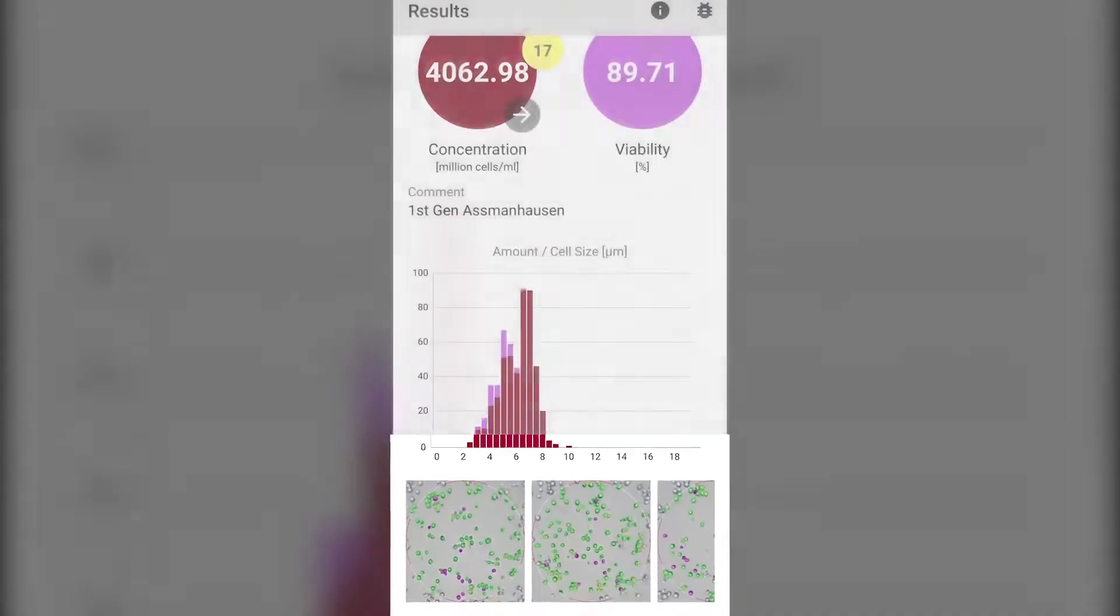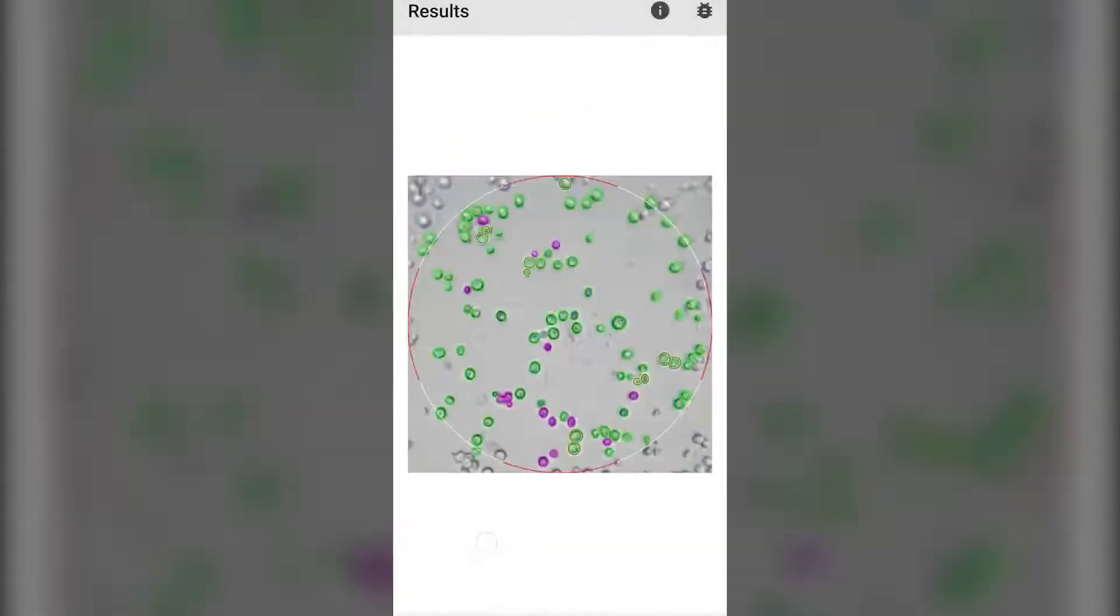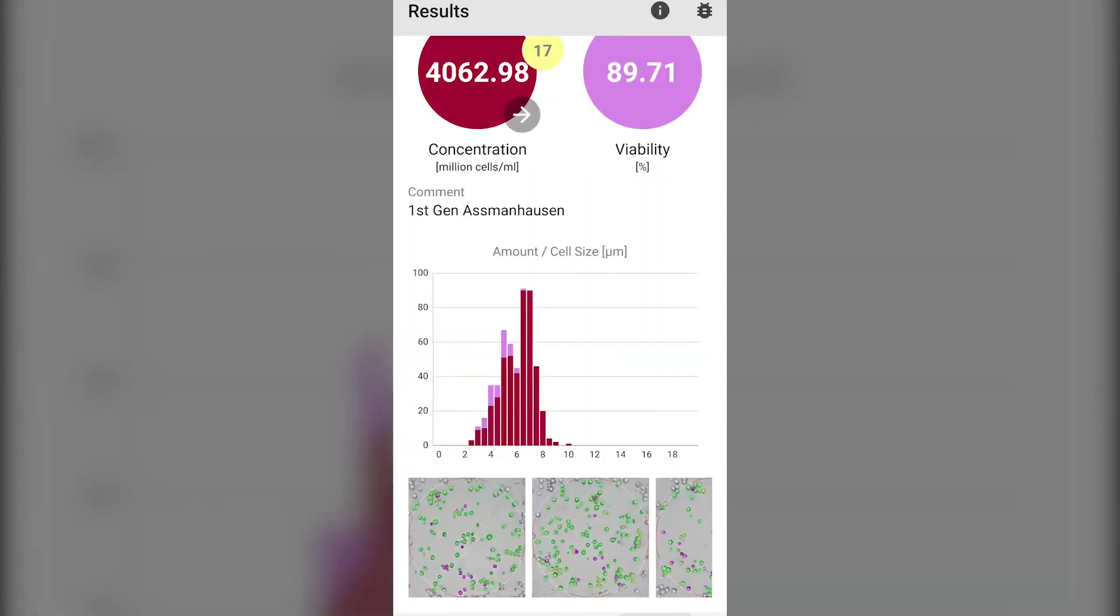Scroll down further and you can see how the algorithm has identified the cells. The green cells are the living cells, the violet cells are dead, while the yellow color indicates budding cells.